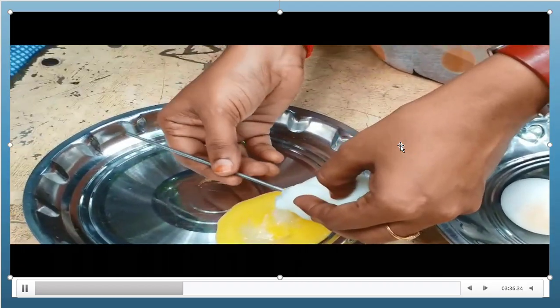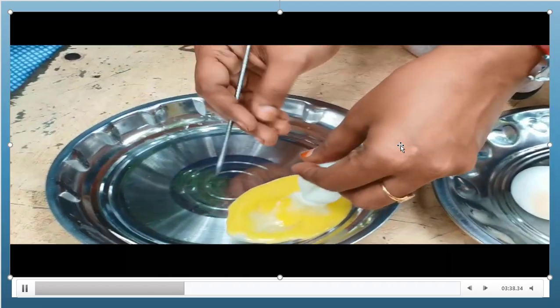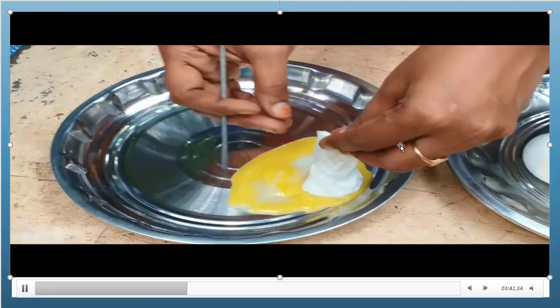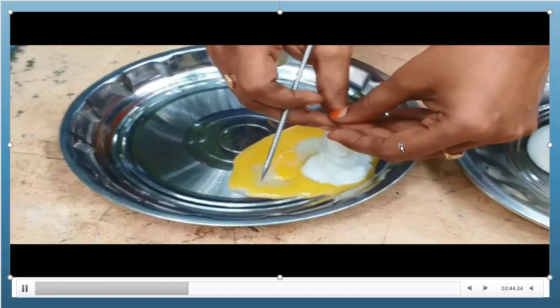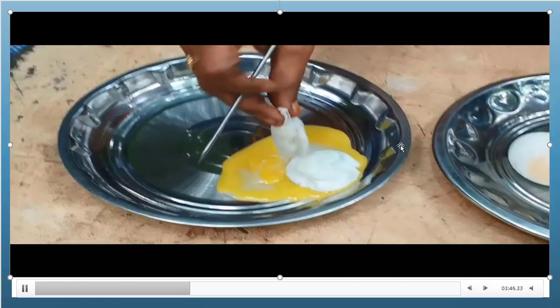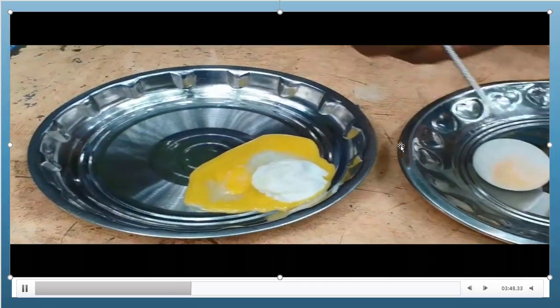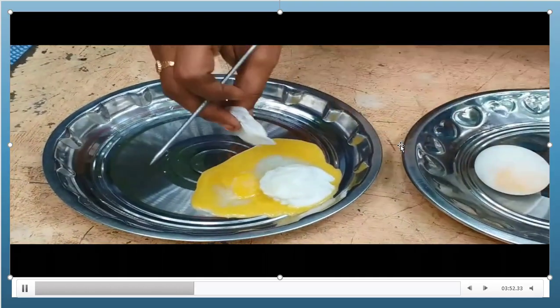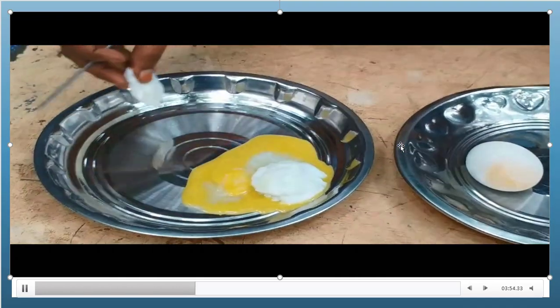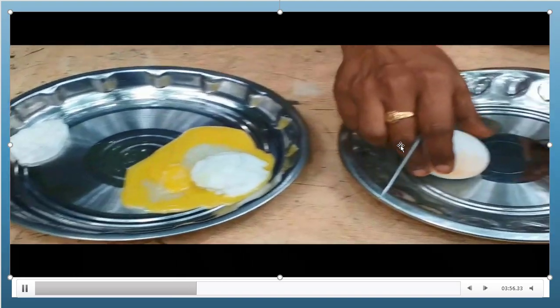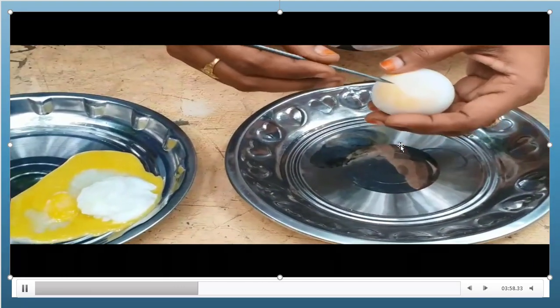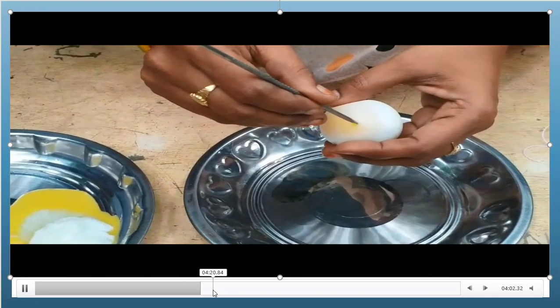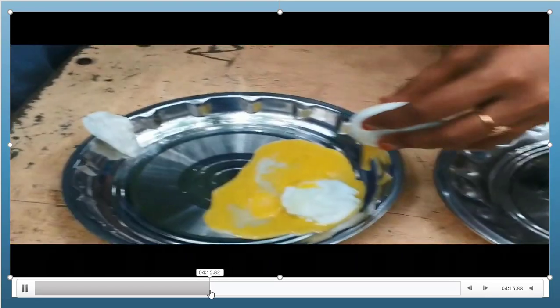We can see the visceral part coming out. Finally, we have the egg membrane. What we have to do next is clean it — pour water inside the egg membrane and clean it properly. Similarly, we clear the second egg membrane.